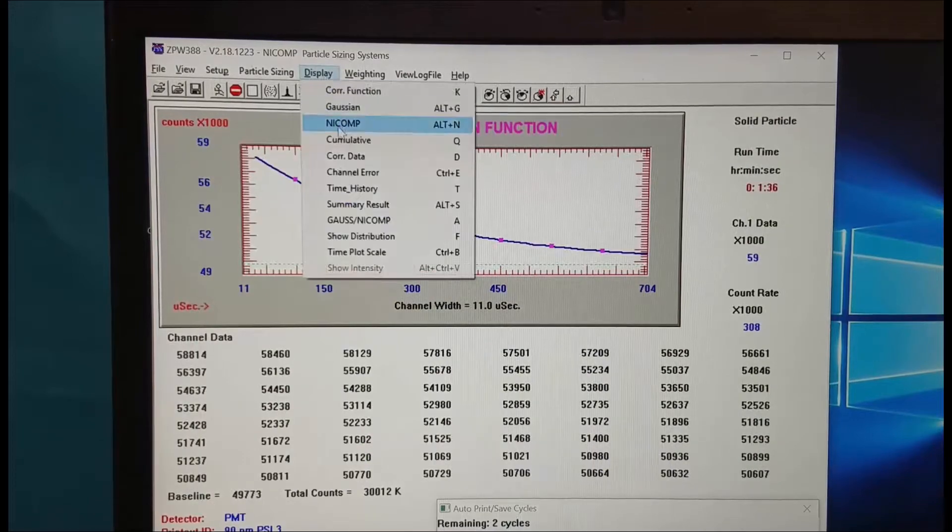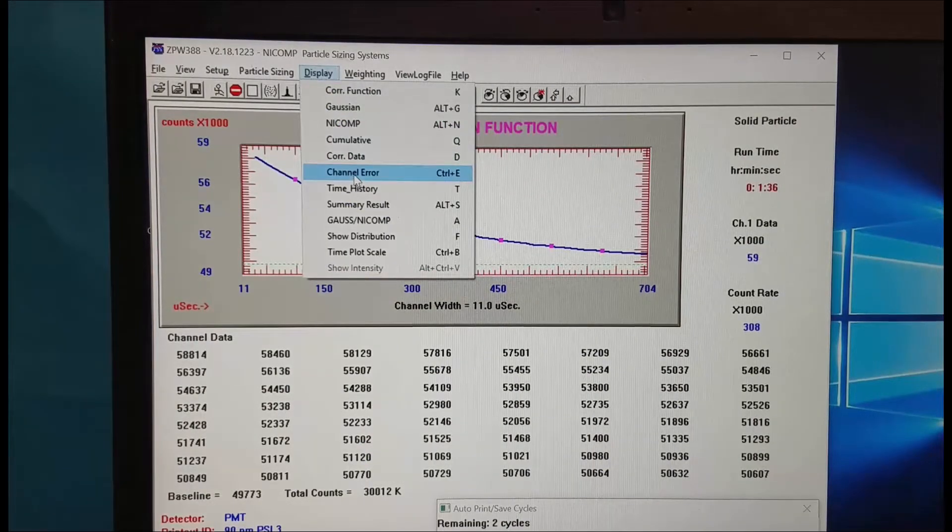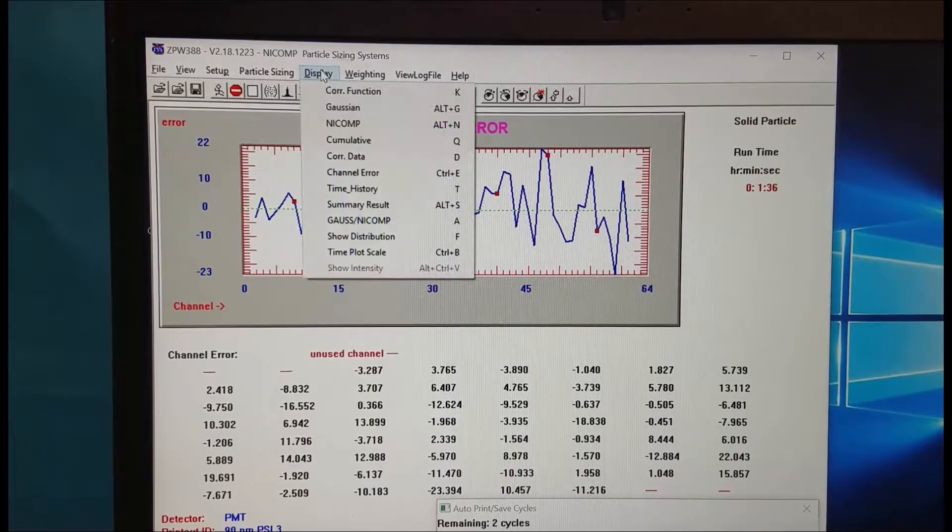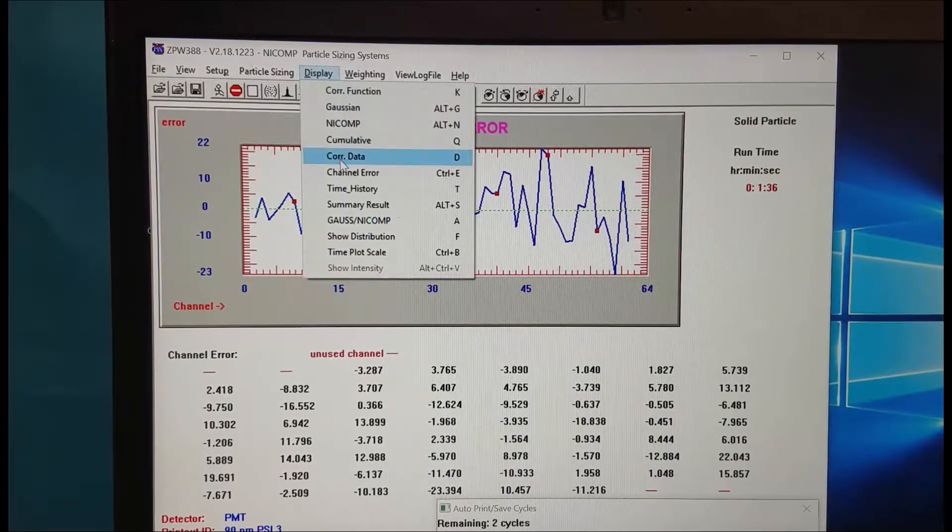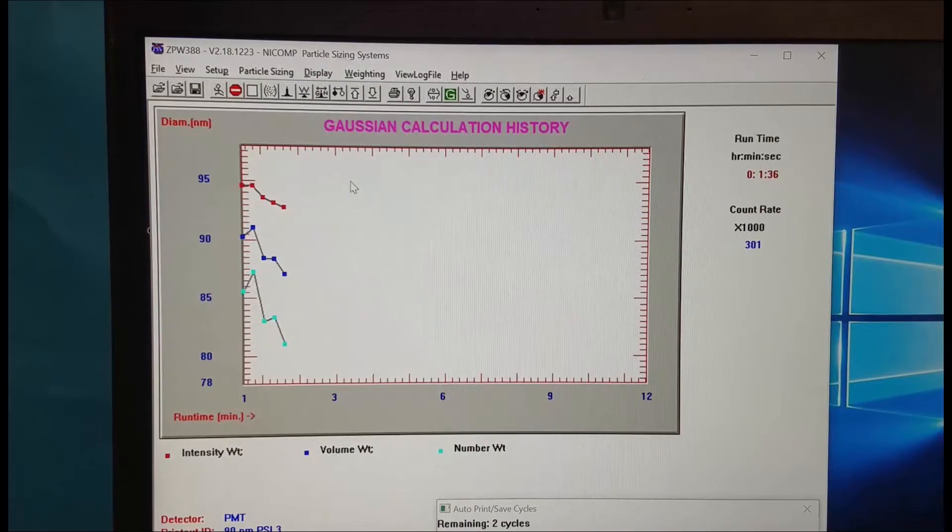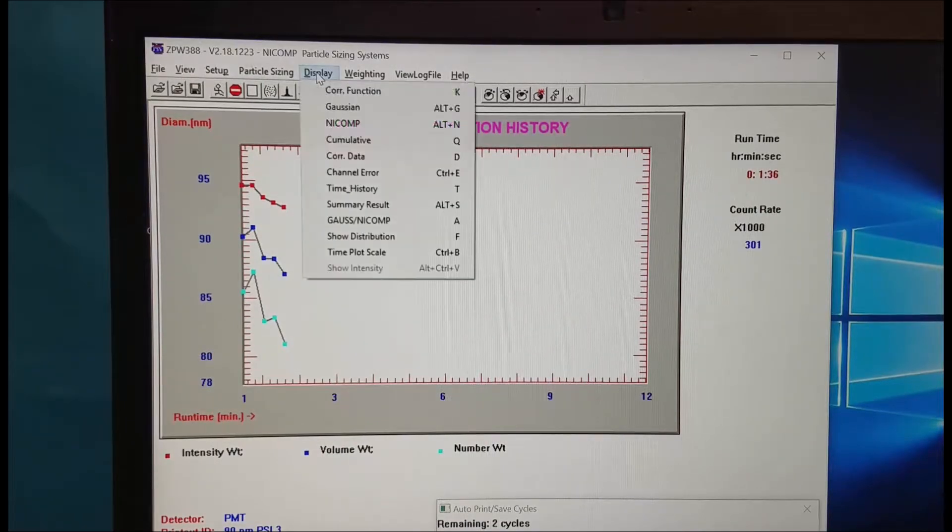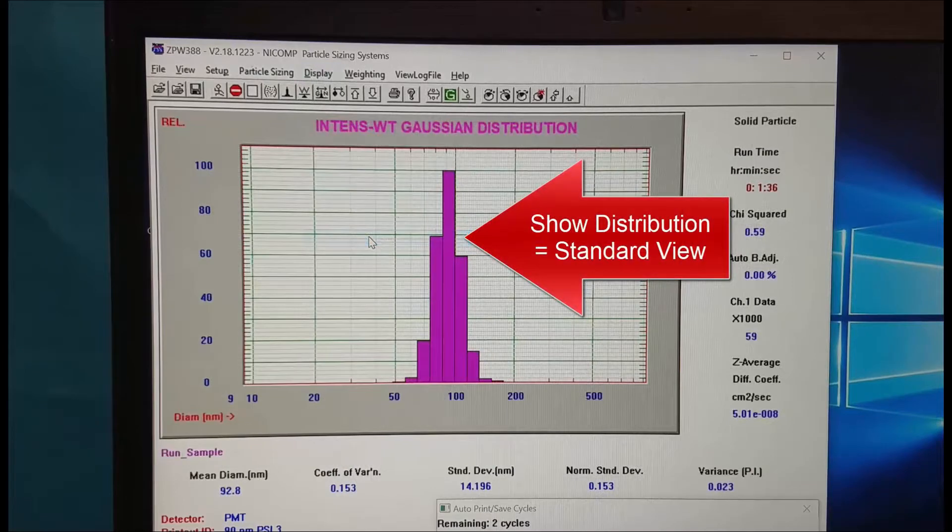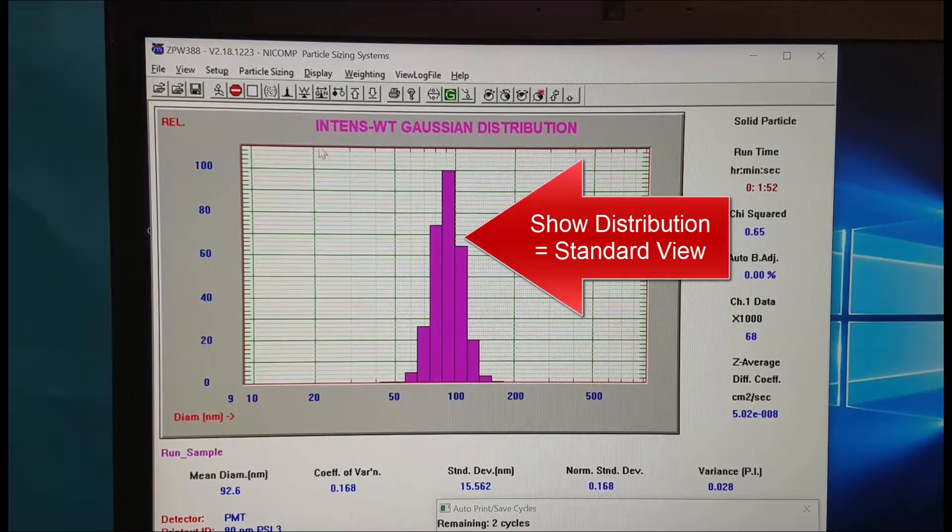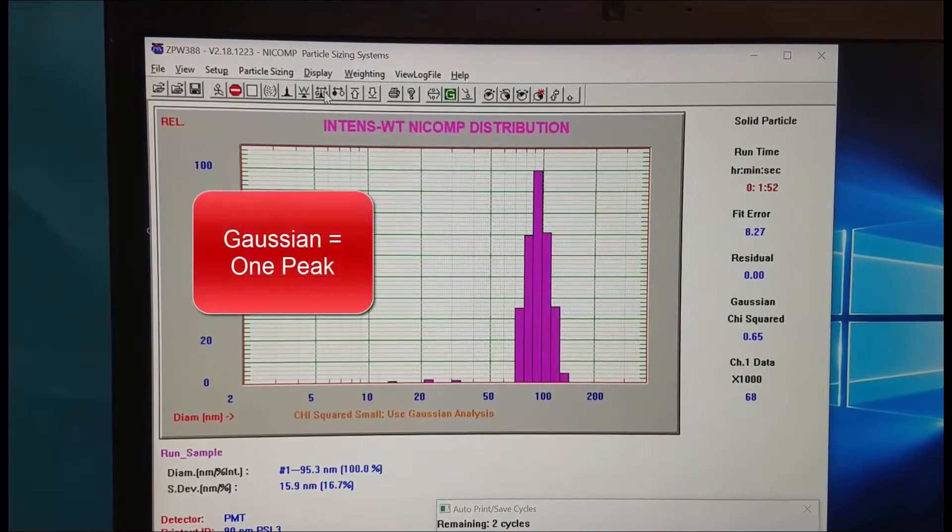Not much we can do with it. We can look at the channel error where we want a random distribution of noise. We can look at the time history again. We see the red intensity mean hasn't stabilized yet. We need to keep measuring. Go to show distribution to come back to looking at the particle size distribution.